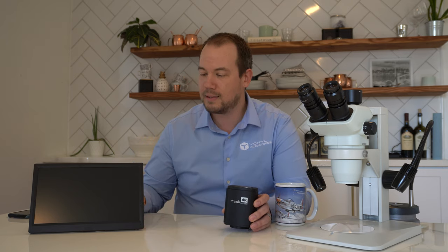So today we're going to be taking a look at the Excelis 4K camera from AccuScope — their latest release, and a follow-up to the Excelis HD.